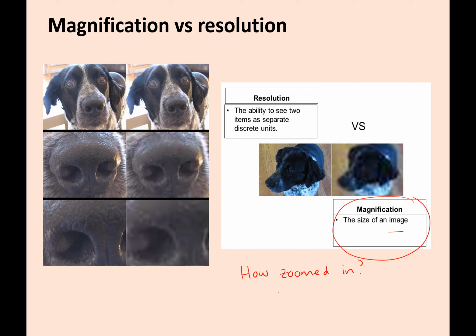Okay. And you have changed magnification if you've worked with a microscope by using different objectives. And you might have used a 4x and a 10x and a 40x, and if you were lucky you got to use the 100x objective, which means it was magnifying things 100 times.